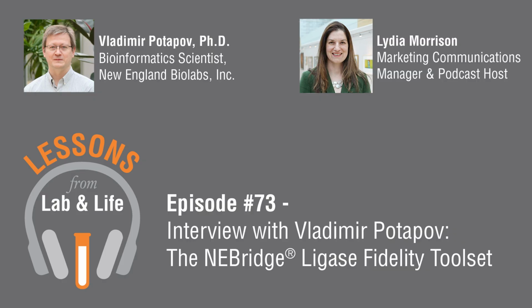As a bioinformatics scientist in the research department, we develop tools internally and externally to address specific problems. And usually the way we develop the tools is to help conduct the research. And when we conduct the research, the goal can be shifting, because you're trying to develop a certain assay. And when you start working on it, you realize that you need to do some improvements, adjustments. So when you change the experiment, you have to adjust your analysis workflow.